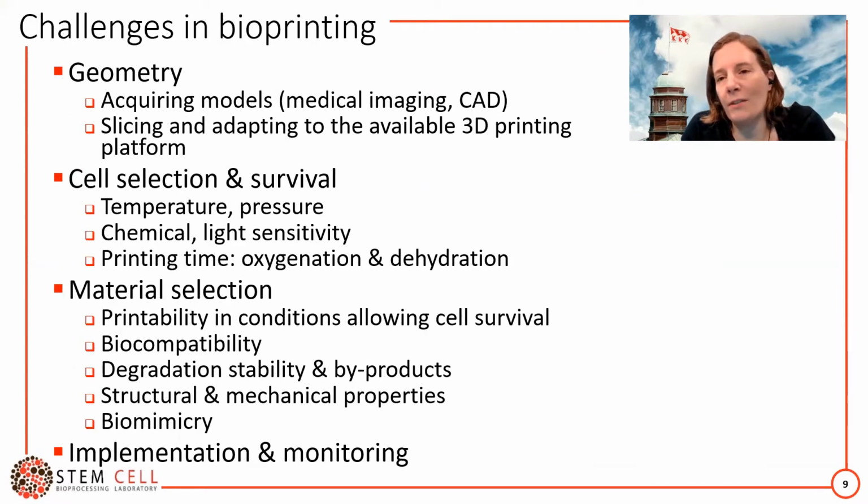There are a lot of challenges when you get into the 3D printing or into the bioprinting field, so printing of live cells, but 3D printing in general. So how to determine the geometry that you want to print, and then how to convert that geometry into something that's actually printable. Often you have to slice it and make something that you can deposit layer by layer, for example.